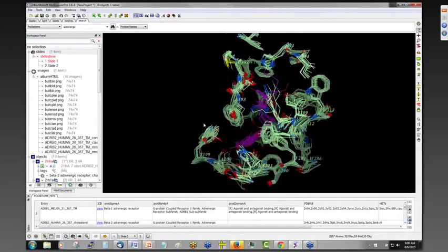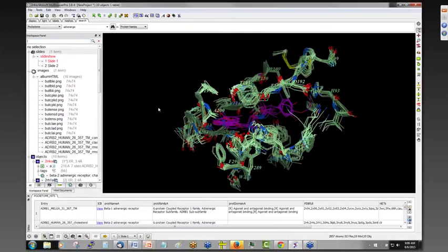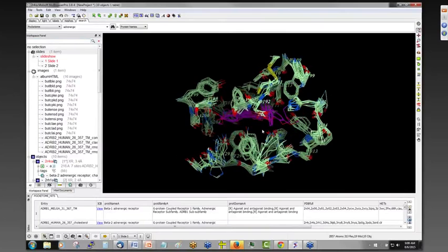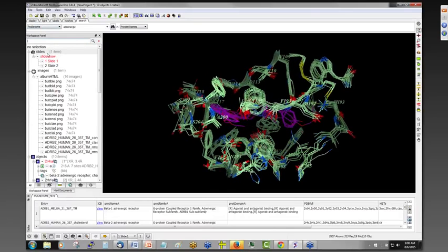So it's a useful tool for docking. You can immediately read in all the PDB structures superimposed, and you can also visually see regions of flexibility in the pocket, for example, to look at. So that's the pocketome.